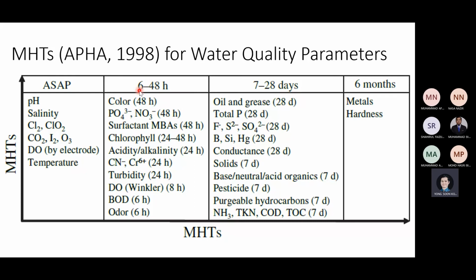Like for example, this one. Once you sample, you only have 6 to 48 hours to conduct the experiment to finish up all these things. So as you can see right there, different parameters, different time frame lah. Yeah. And the other ones, 7 to 28 days.